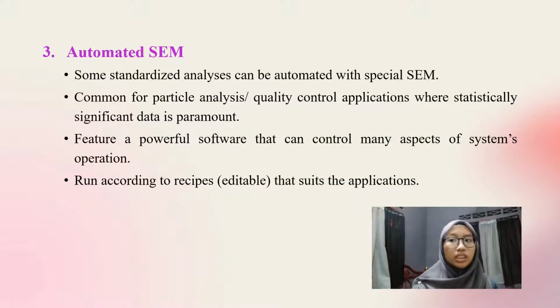The last one is automated SEM. This automated SEM uses a recipe because some standardized analysis can be automated with this special SEM. It is common for particle analysis or quality control applications where statistically significant data is paramount.